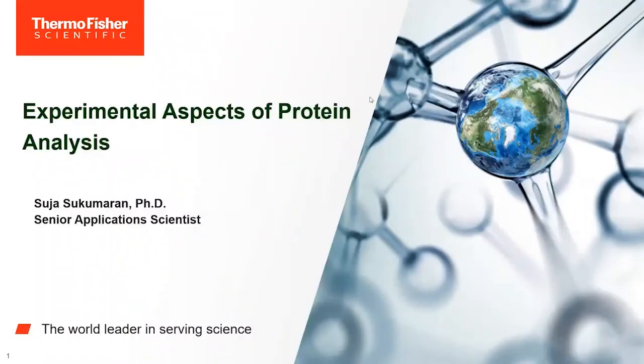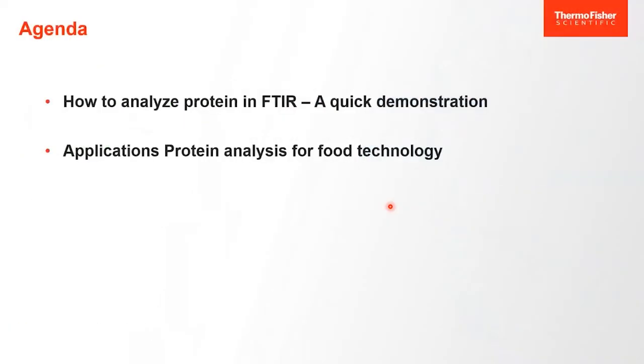Fantastic presentation, Professor Mäntele. Wasn't it a great introduction to protein analysis and the next generation of biomedical devices based on IR spectroscopy? I thought so. So what I am going to talk to you about today is experimental aspects of protein analysis. My agenda today is to show you a quick demonstration of how to analyze proteins in FTIR, as well as how to use protein analysis for some applications in food technology and research.